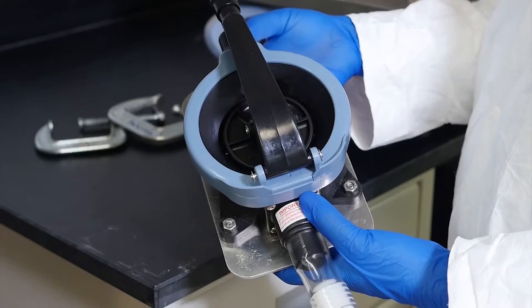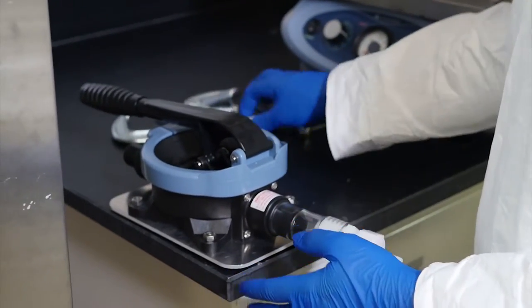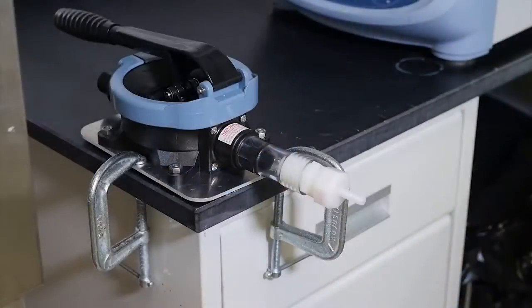A bilge pump will drive the elution process. Secure the bilge pump outside the biosafety cabinet using two C-clamps. The bilge pump is located outside the biosafety cabinet to prevent contamination.